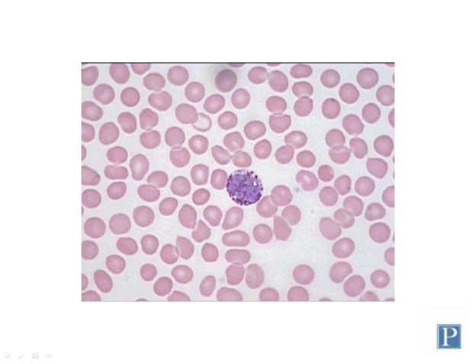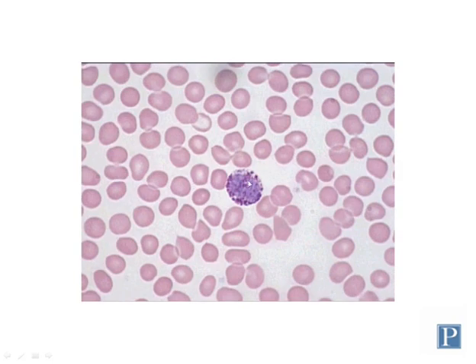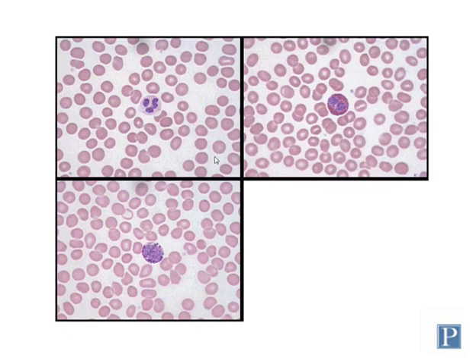So if you can, besides looking at the color, you can also look at the shape of the nucleus. If you can see the nucleus easily, you know this is an eosinophil. Sometimes when you're looking at a basophil, it's hard to tell whether it's more purple or bluish or more reddish in color. But if you look at the nucleus, that's another important clue you can use to distinguish between those two cell types. So here's a composite image of 3 blood smears. Here you have a neutrophil, here's an eosinophil, and here's a basophil, so you can compare and see what they look like.